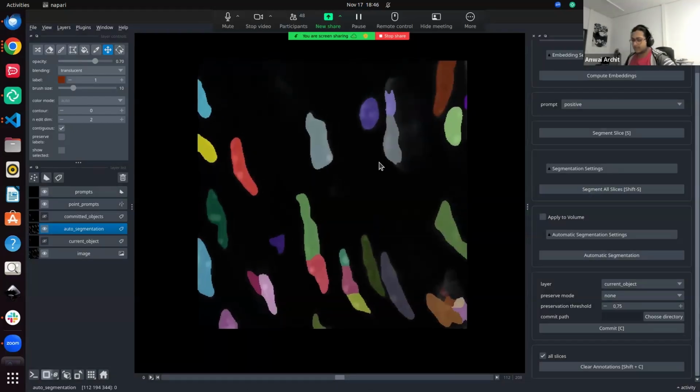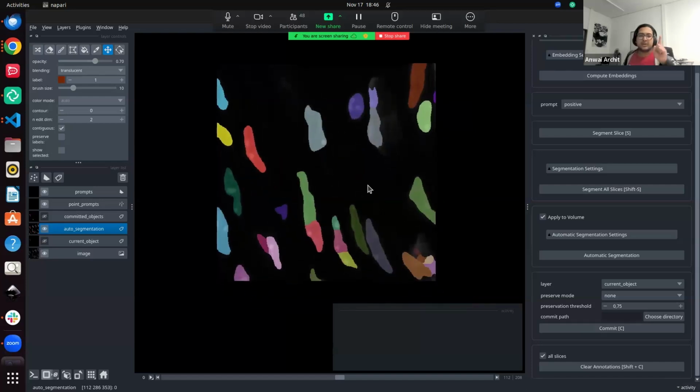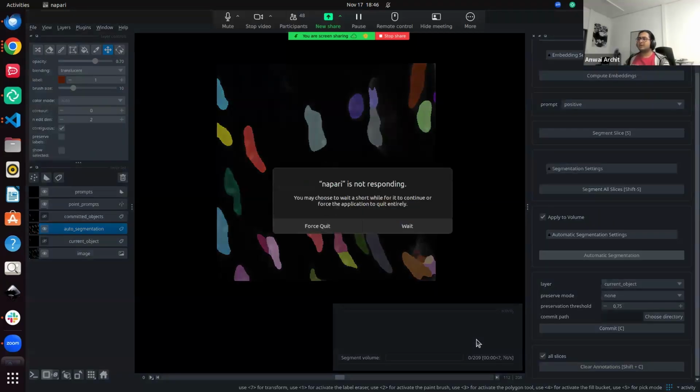So for this one, let's say if we switch this on and off, it did a good job. Some places it did a bad job for this long cell over here. But let's probably ignore it and see how it works for the entire volume. So we select the entire volume, we zoom out. The room is open for questions because this takes a few minutes. Automatic segmentation, you will see a feedback over here. I hope that is not too slow, but then are there any questions?